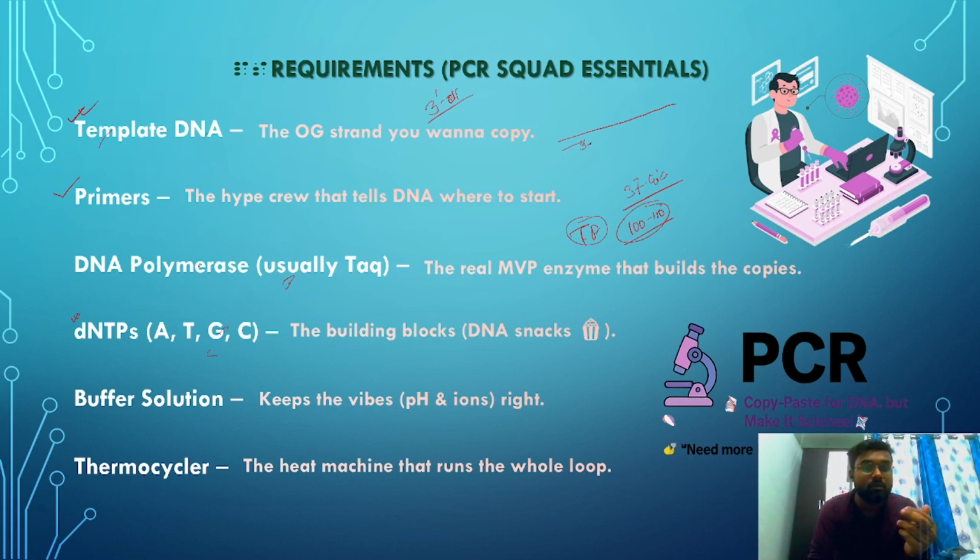Who is the building blocks? That is dNTPs, deoxynucleotide triphosphates. Next, what do we need? Buffer solutions. What is the requirement for buffer solutions?